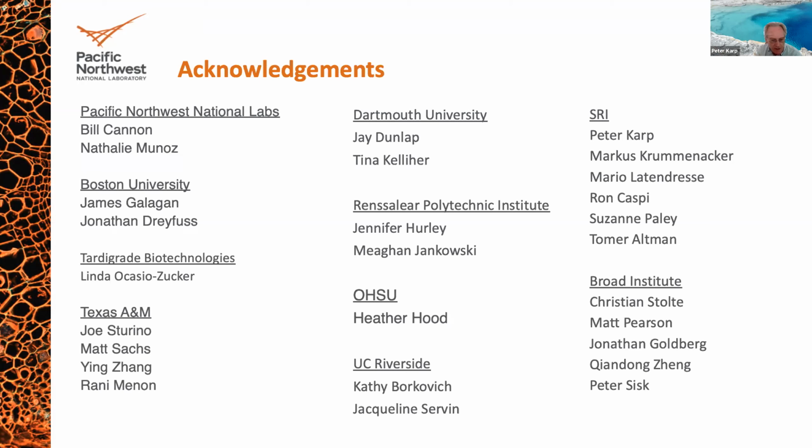Then there was a question about what I just said about metagenome PGDBs. They're asking, how do we arrange the bins of different organisms in a sample? You basically just create a separate directory, a separate folder, where each folder contains data from one organism. And you can manually run those through PathoLogic, or you can use our batch command line version of PathoLogic to process each organism in turn. And each time you invoke it from the command line, you give it a different directory as the source of the data.